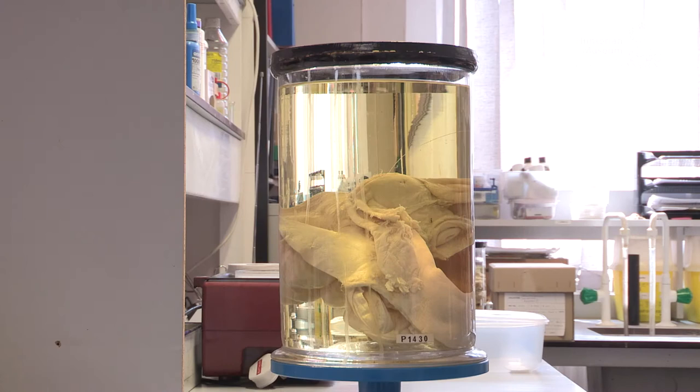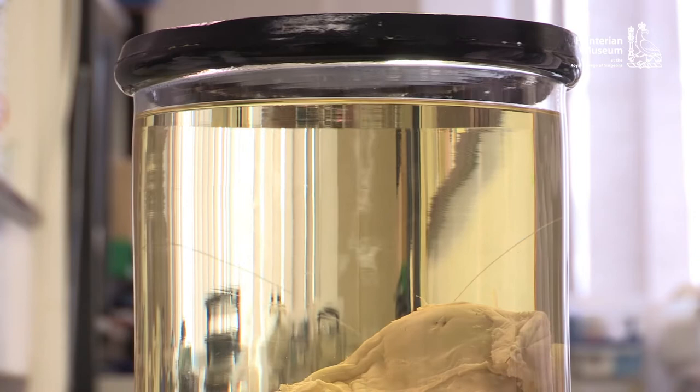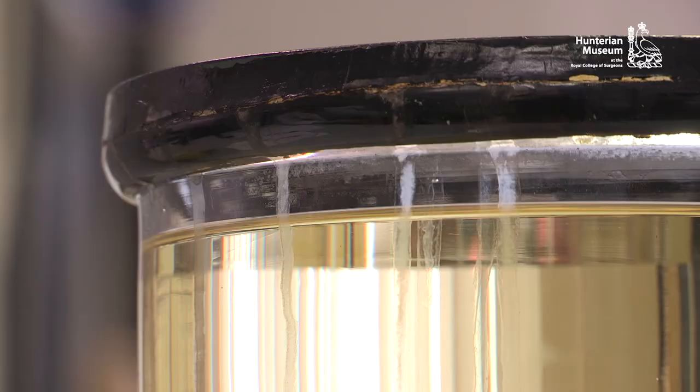Inevitably, deterioration of the preparation will occur, and specimen number P1430 demonstrates some typical problems that require attention. The linen threads have disintegrated and snapped, causing possible damage to the specimen during movement. The fluid is discoloured, and the sealant has dried and cracked, allowing evaporation and leakage.